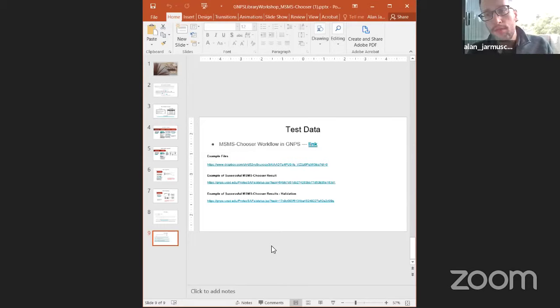It's going to look for scans matching that exact mass. So the challenge there is it may not pick the right one. With the flow injection method, because we're analyzing a single chemical standard, the likelihood of picking the right mass is very high. And we have tried it on data not collected with our standard method, and it does in fact work. Morgan and Emily can probably talk to you a little bit more about their experience offline. They did this on their bile acid standards, which were complex standards, and it really facilitated them getting the data into the database much faster than you would be able to do manually.